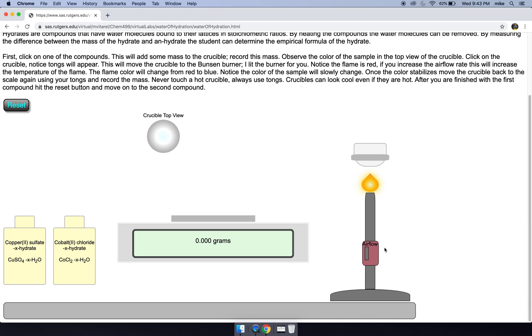So again, let's keep the air flow rate high, the flame blue, and it'll rapidly desiccate our sample. We can move our sample back and forth until the mass remains constant.